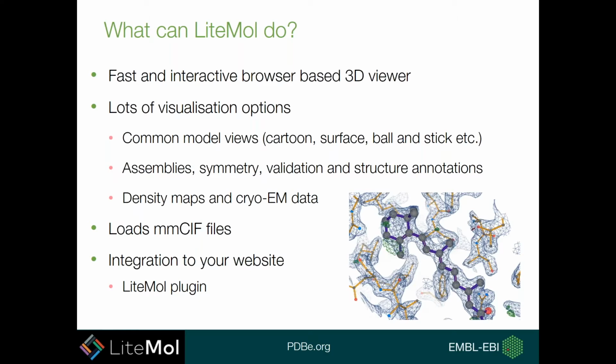Mainly we use PDB entries, but if you want to load your own mmCIF file, you can do this through Litemol as well. There is also the option to integrate Litemol into your own website as well.